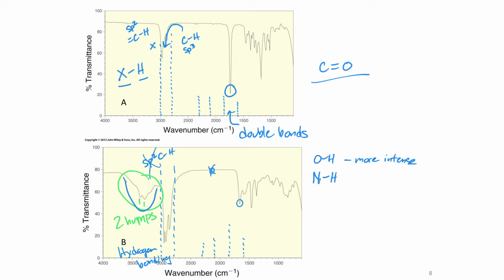This hump that I've drawn only stretches to about 50% of transmittance, and so I think we probably have NH bonds. And because there's two humps, that equals, we have an NH2 group. Each of the hydrogens can essentially stretch or bend in different ways, and that gets us two different intensities at two different wave numbers of absorbances, and that is what causes the two humps.